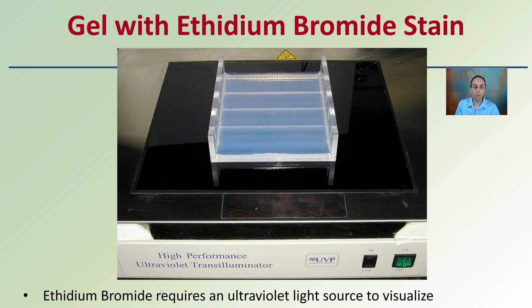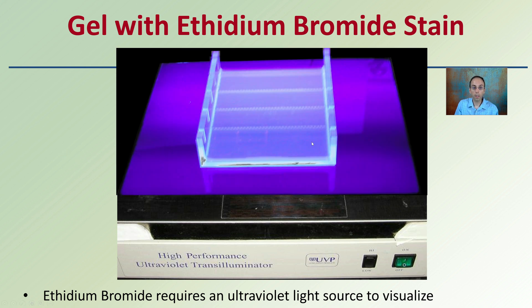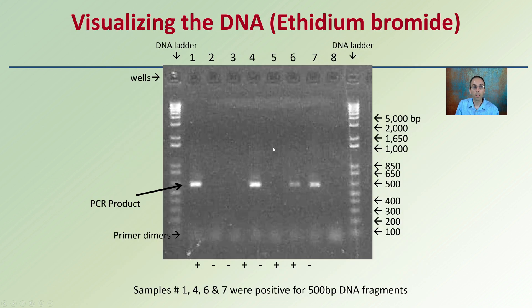Here is a gel with ethidium bromide stain placed on a UV light transilluminator. Ethidium bromide requires ultraviolet light to be visualized — with the UV light off you really can't see anything, but when turned on, banding becomes visible. Protective glasses should be worn when viewing. For example, samples 1, 4, 6, and 7 were positive for 500 base pair fragments — demonstrating the ability to separate DNA and determine whether a certain fragment or base pair length is present.